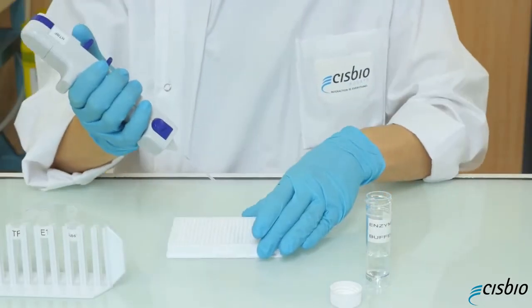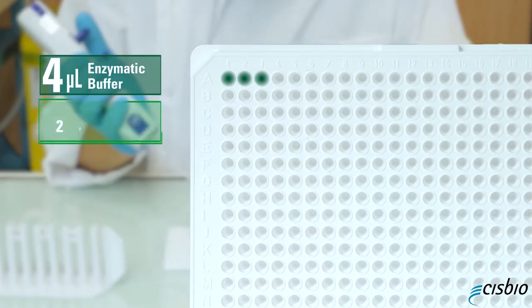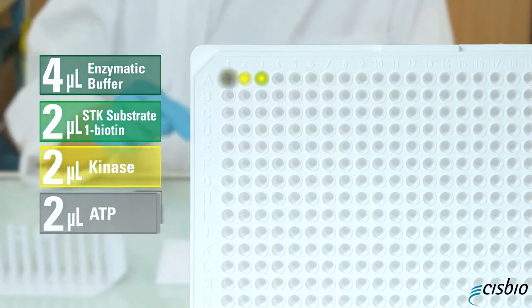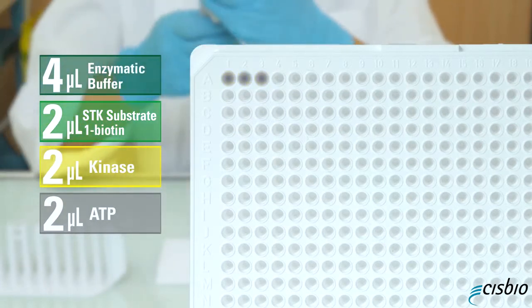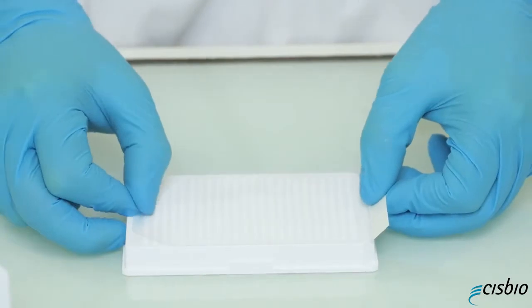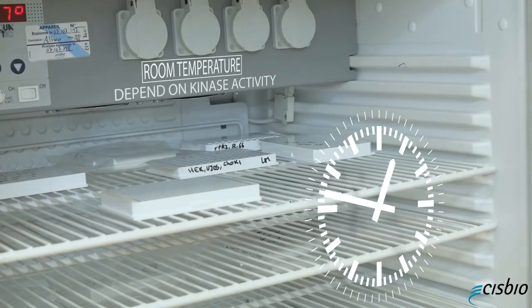For the enzymatic step, dispense 4 microliters of enzymatic buffer with 2 microliters of STK substrate 1 biotin, 2 microliters of kinase, and 2 microliters of ATP. ATP will start the reaction. Seal your plate and incubate it at room temperature. The incubation time will depend on the kinase activity.